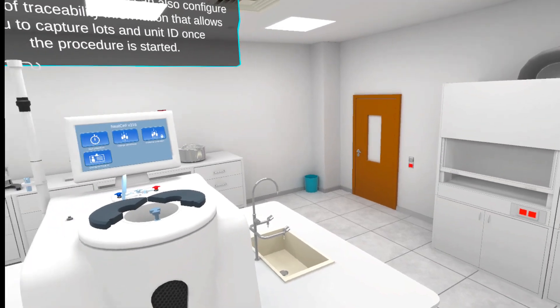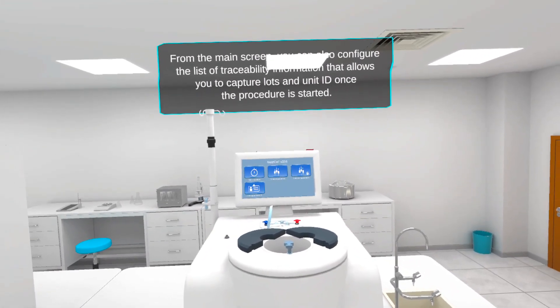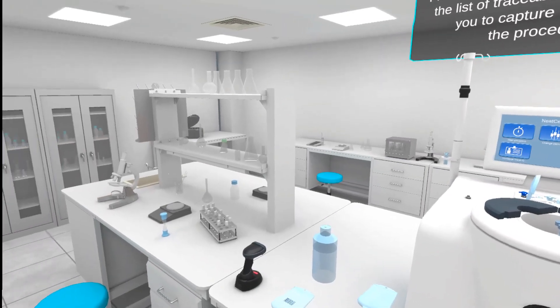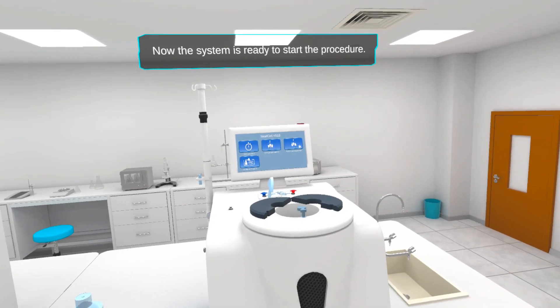From the main screen, you can also configure the list of traceability information that allows you to capture lots and unit ID once the procedure is started. Now the system is ready to start the procedure.